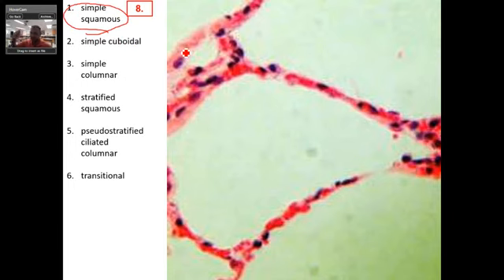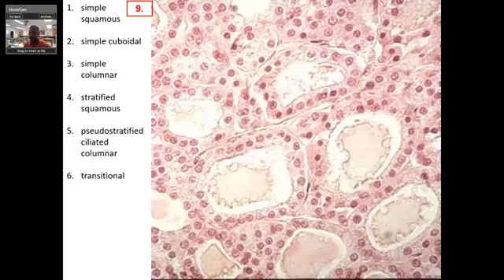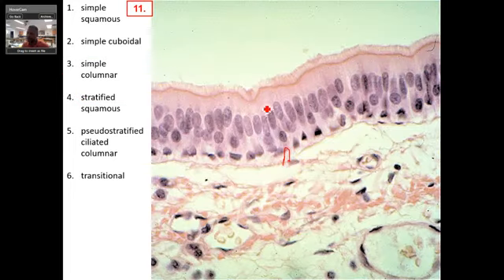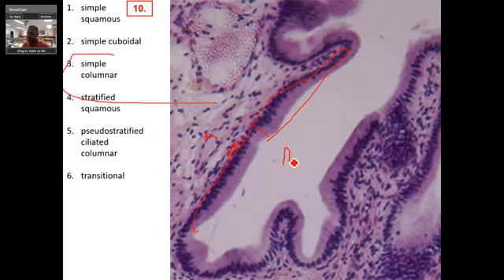It's another view. And you have to look at how you get these shots during the cross sections here. All right. Next, simple cuboidal. This is going to be the columnar. Okay. Simple columnar. That's the whole cell. This isn't blown up like the other cells. So here's your basement membrane. Here's your apical. Well, let's go back to that for a second. Here is the lumen right here, and then this would be your AP, which is your apical surface. That's written very poorly.